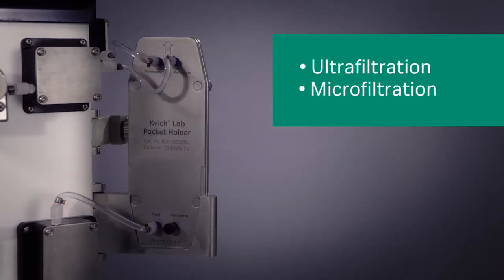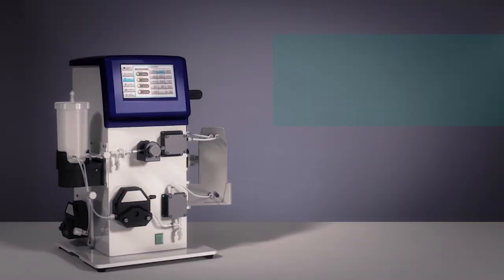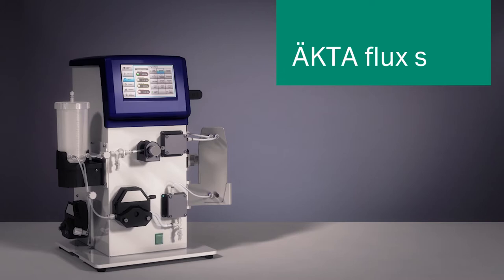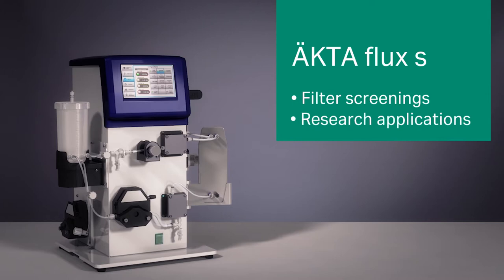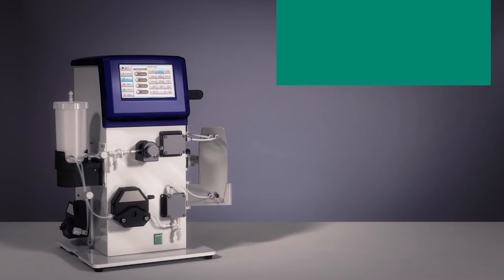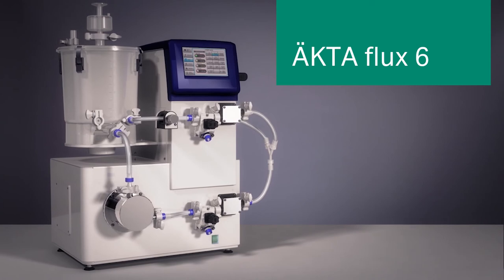Actiflux is available in two versions: Actiflux S with a reservoir volume of 0.5 liters, commonly used in filter screenings and research applications, and Actiflux 6 with a reservoir volume of 8 liters, suitable for use in process development and small scale production.